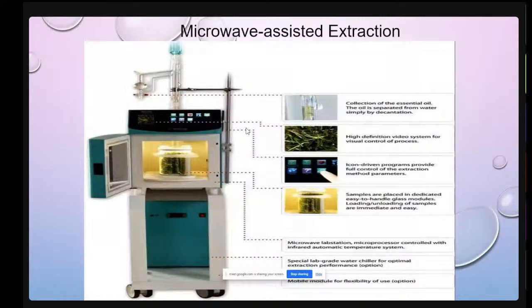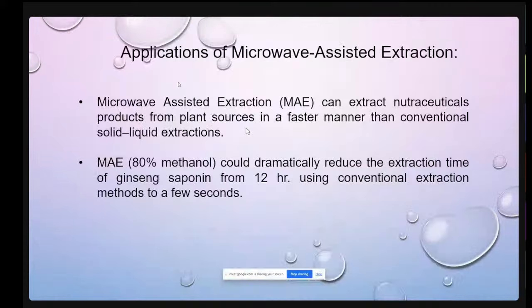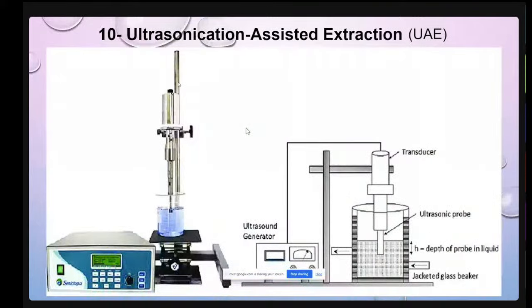This is the microwave assisted extraction. It is a special instrument that needs a microwave. Also, there is a type of extraction with ultrasonication assistance.